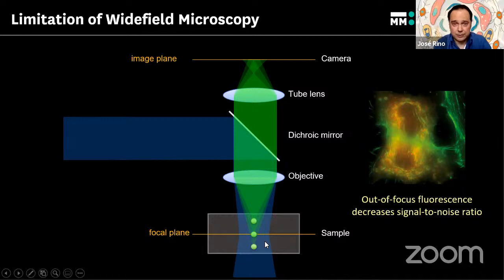So particularly if you're trying to image a brain, for instance, with fluorescently labeled neurons. As you can imagine, there are many of them. The brain is very, very thick. So this might be a problem. You might not even be able to image anything fluorescent in the brain.